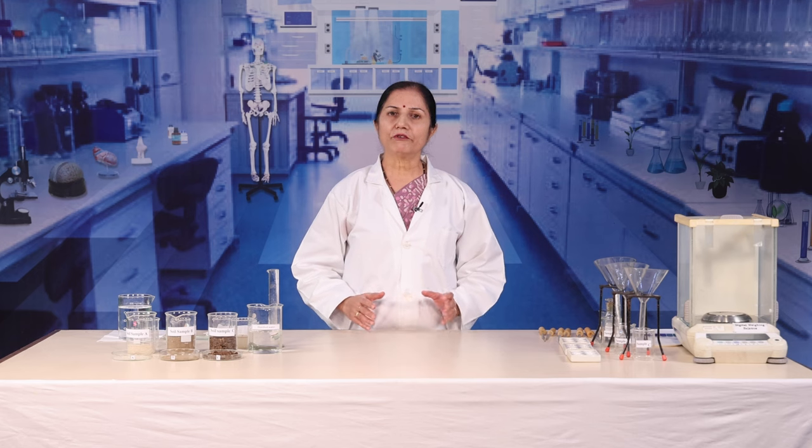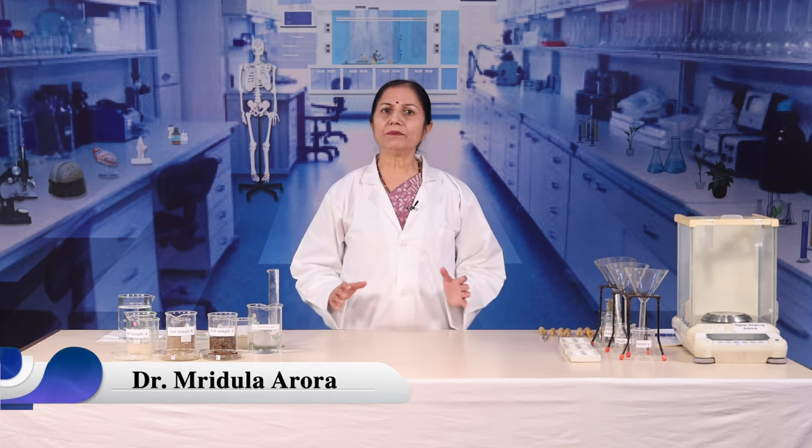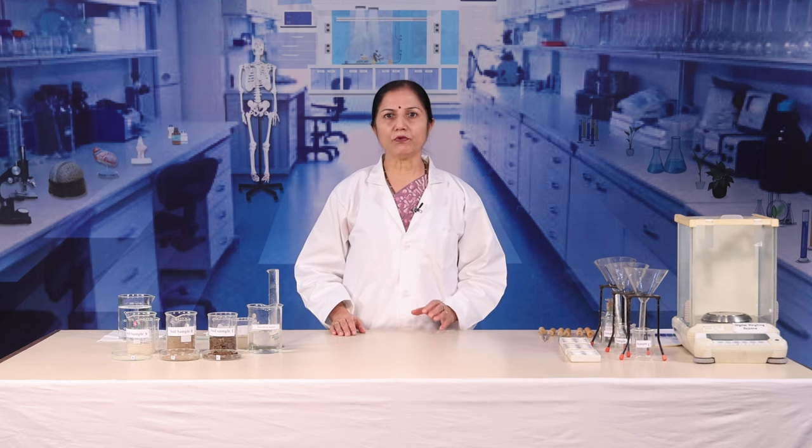Hello, dear learners. In this session, our aim is to determine the pH of different soil and water samples. As we know, pH is a measurement of hydrogen ion concentration in a given solution. Soil pH is an important parameter affecting the growth of plants, as it governs the availability of nutrients to the plants. Similarly, pH of water determines its solubility for nutrients and its bioavailability to different life forms.